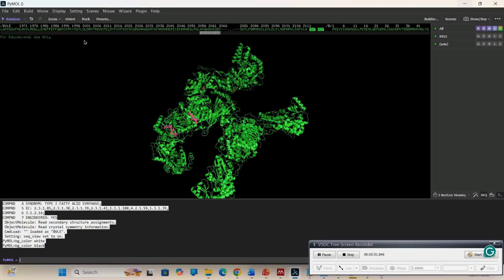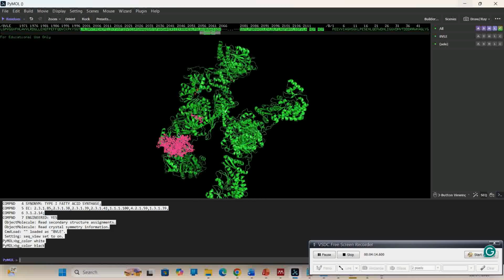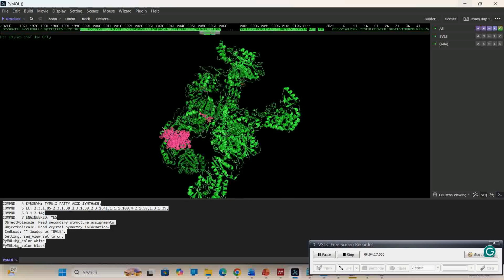So we will come here and create a selection. Let's start from, say, 2000. Let's say this is 2001. So let's start from here, and we just select all of these up to this point. Okay, we can see now that of the two NDPs, the cofactors, one has been selected. Okay, let's deselect again and then see exactly what transpired.